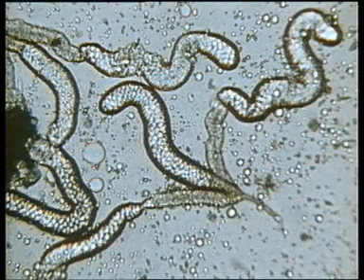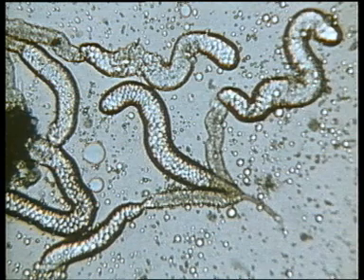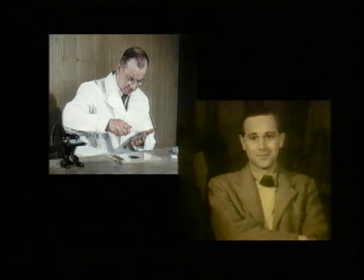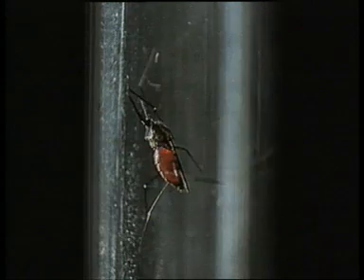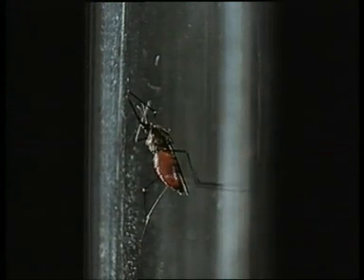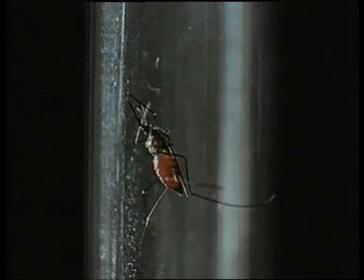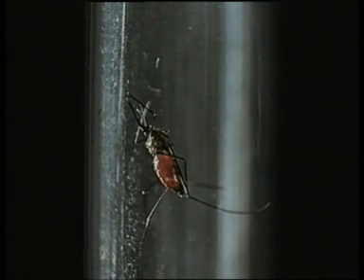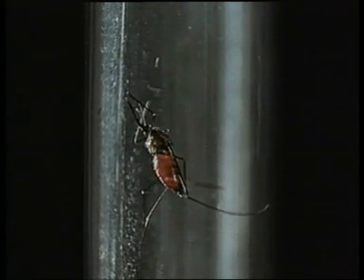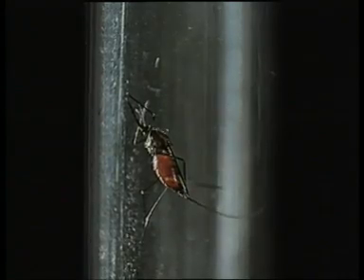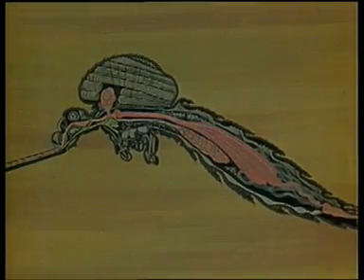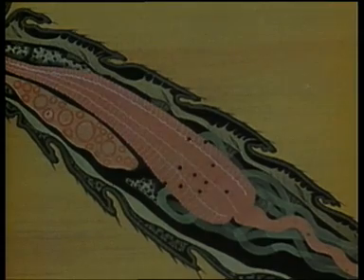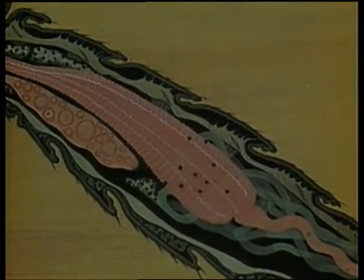This can be done by dissection under a microscope. The following demonstration, filmed in 1953, was carried out by P.G. Schutt and R.S. Bray. If a recently fed mosquito is captured, its stomach will be distended with blood. It's best, therefore, to keep it for a day or two to allow the blood to digest and prevent the distended stomach from being broken during the dissection. During this time, the oocysts will mature.